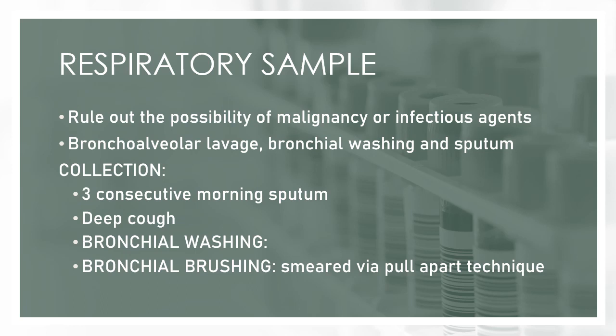Aside from those, you also rule out the presence of Pneumocystis carinii infection. For your respiratory sample, this is actually collected using bronchoscopy. So you have here your samples for your respiratory sample.